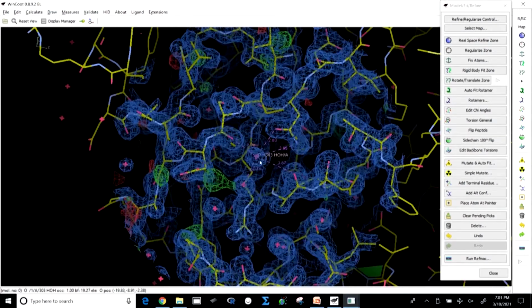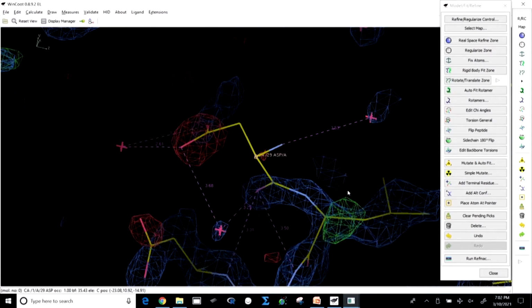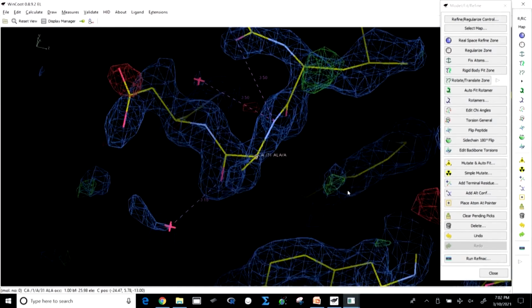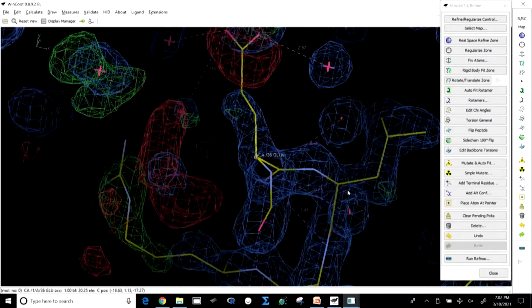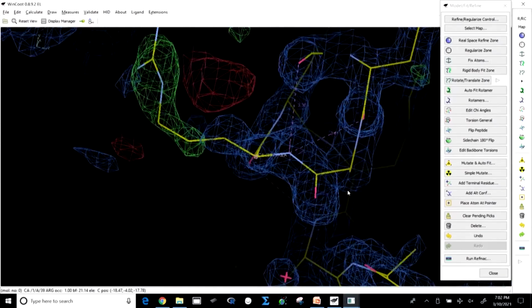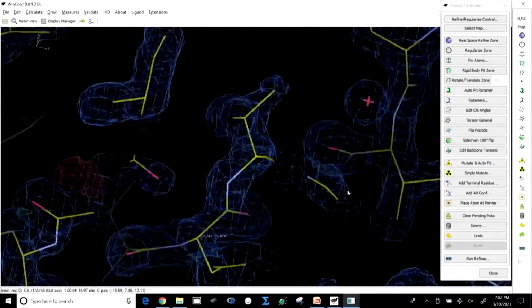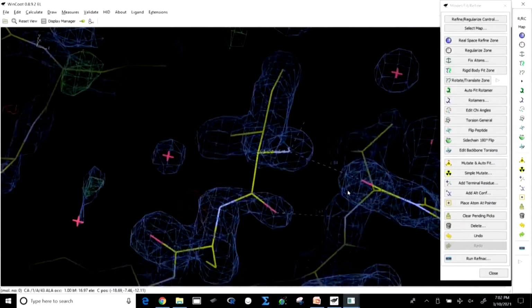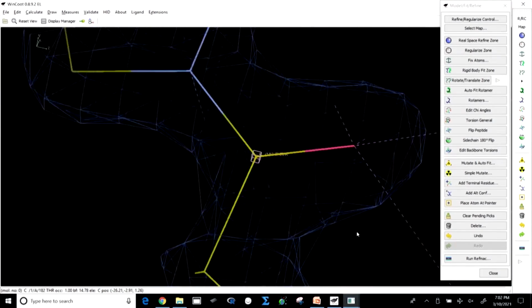Now, if you go somewhere, you see the interactions, but the better thing is you could just continue it by clicking the shift bar. You could click and shift and you see all the interactions. By doing that, you could make a tour of the whole structure without doing much work. That is also a beautiful property of COOT.